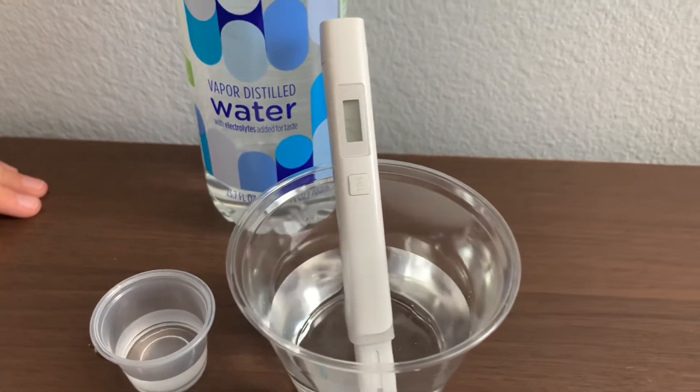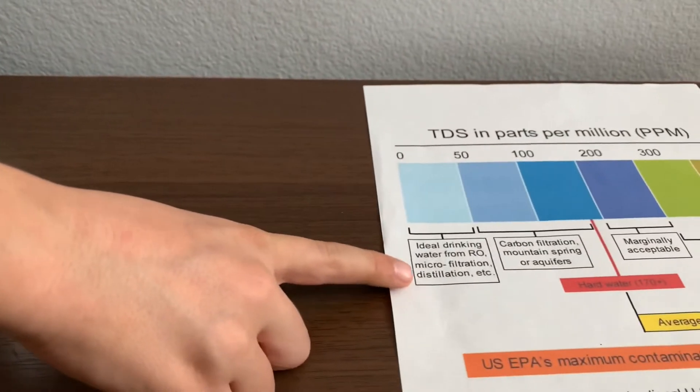I give this a 23. This is micro-filtered distilled water.